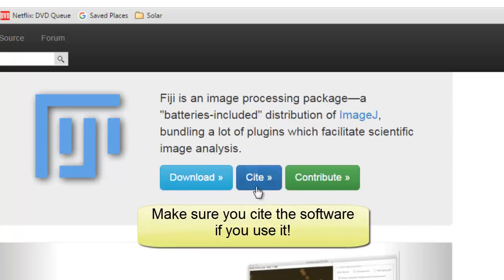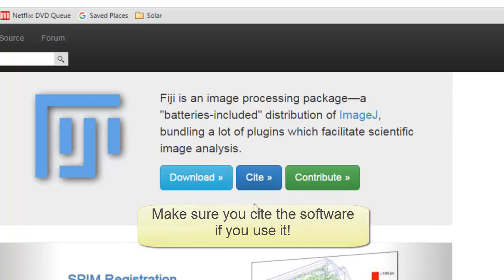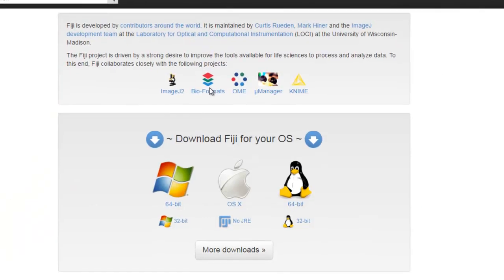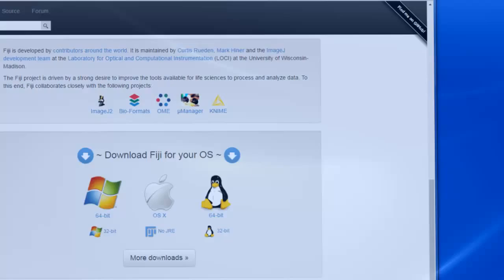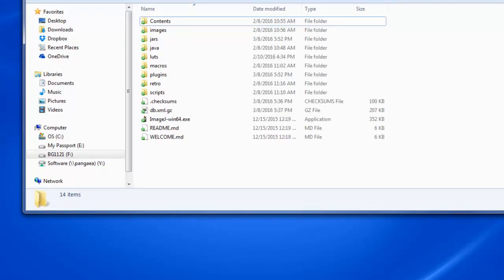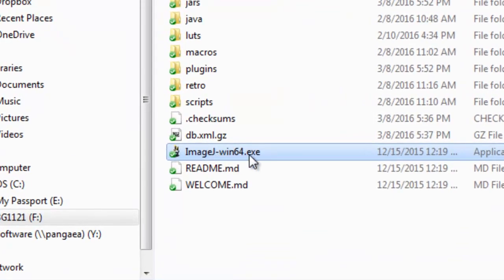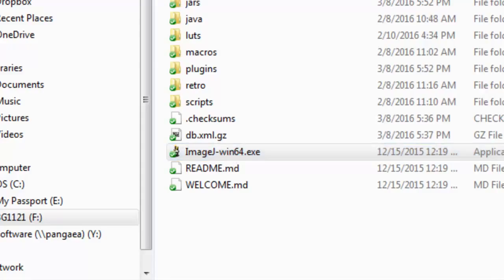There's a button right on the web page you can click that gives you information on how to cite it. If you want to get it, click on Download — you can do Linux, Mac, or Windows. I'm using 64-bit Windows. It runs on Java. You just download it, unpack it, and for Windows you find the .exe and double-click it. I made a shortcut to it on my desktop, and that just launches the program.